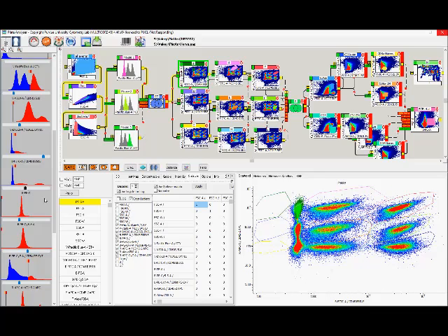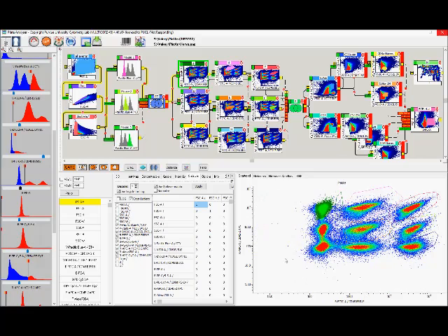So I'll just put that back again, wait for it to finish. Valeri told me to wait, otherwise we might have a crash. And now we go back again and maybe come close, and maybe our gates will fit again. But the point is, be careful, because your gates, no, they won't fit because I've changed these. Anyway, just to show you that's now added to all of these parameters.